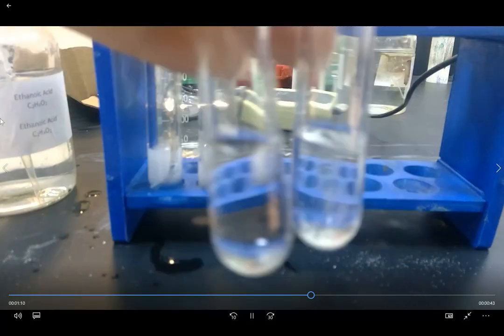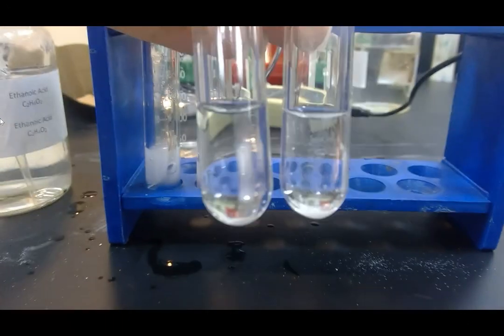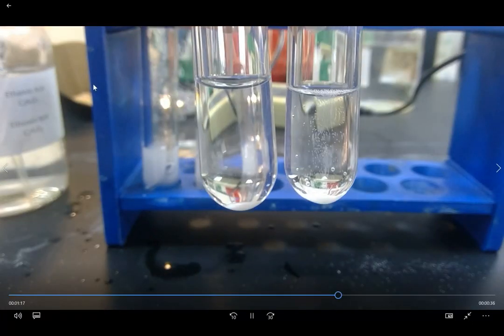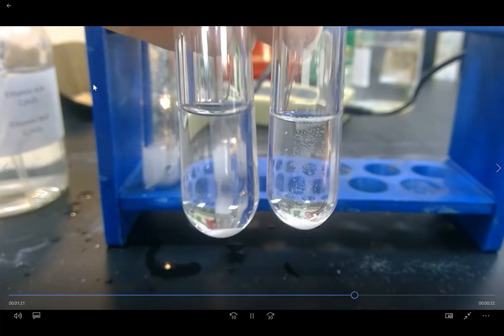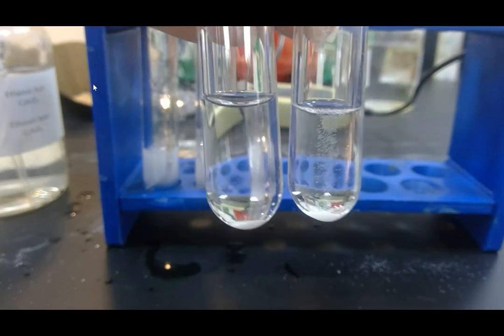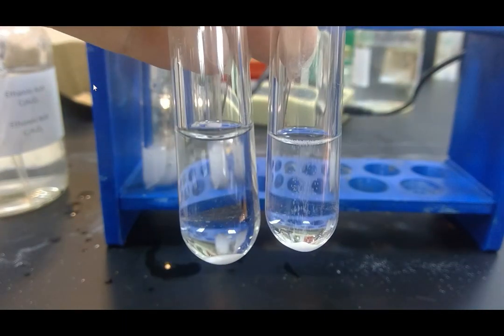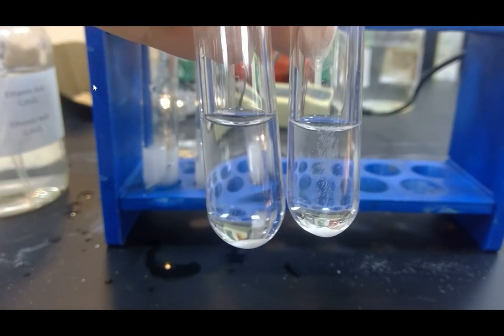So that shows that the reaction with the carbonates is much slower with ethanoic acid than it is with hydrochloric acid. The hydrochloric acid has completely reacted with the sodium carbonate. Sodium carbonate is all gone in the one on the left, whereas in the one on the right, it's still fizzing.